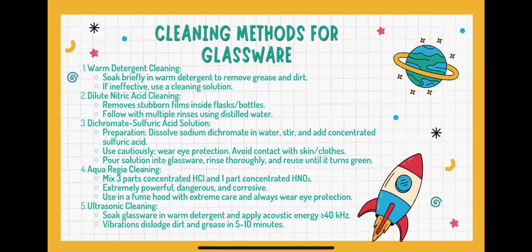The last one is ultrasonic cleaning. For a high-tech approach, soak the glassware in warm detergent and use ultrasonic vibration to remove dirt in just 5 to 10 minutes.